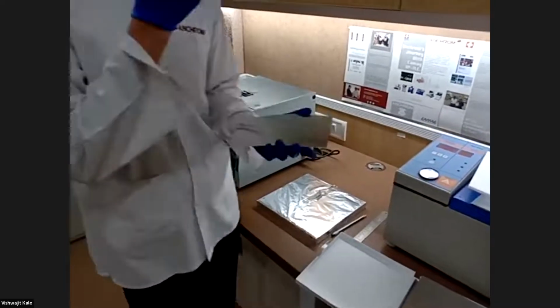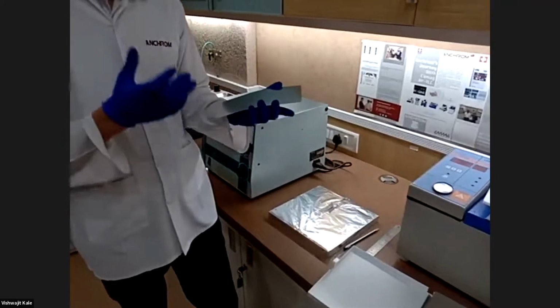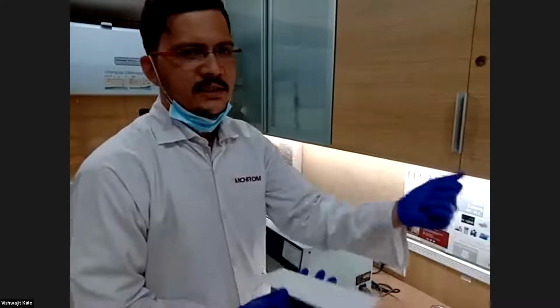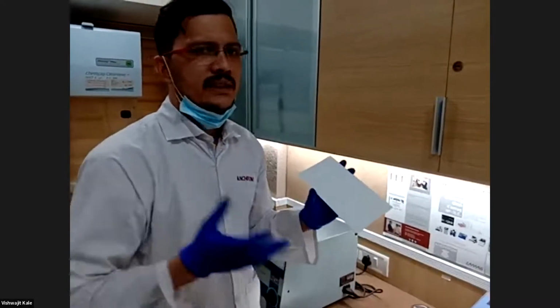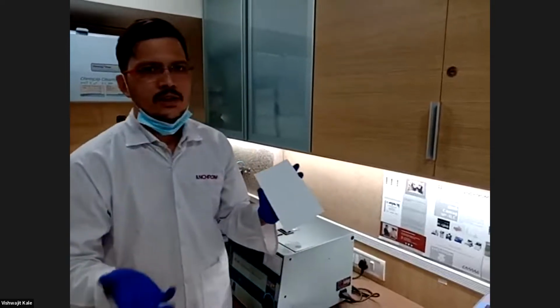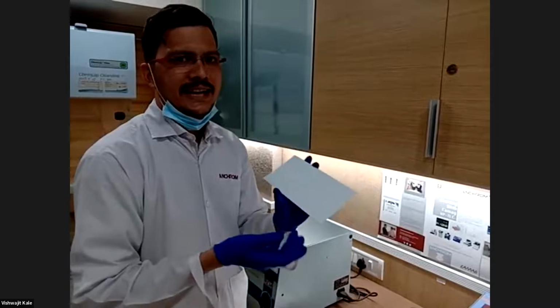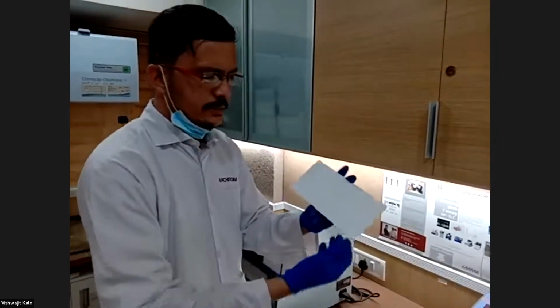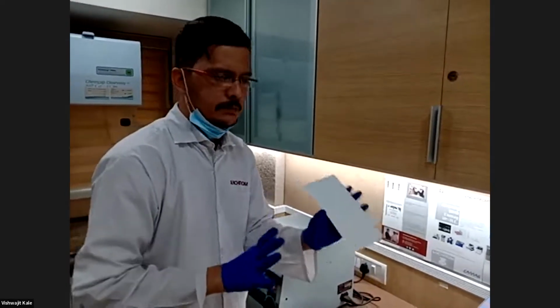And always use a simple paper cutter. Don't use scissors, because scissors will disturb your stationary phase while cutting the plate. And always wear hand gloves while handling the plate. Just imagine that in column chromatography, you are handling your column in the open. So this is again an open planar stationary phase in your hand. So handle it very carefully with hand gloves, and don't keep your fingers onto the plate from the sides. You can handle the plate properly.